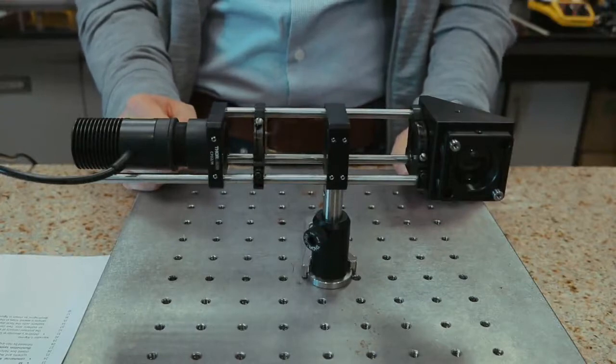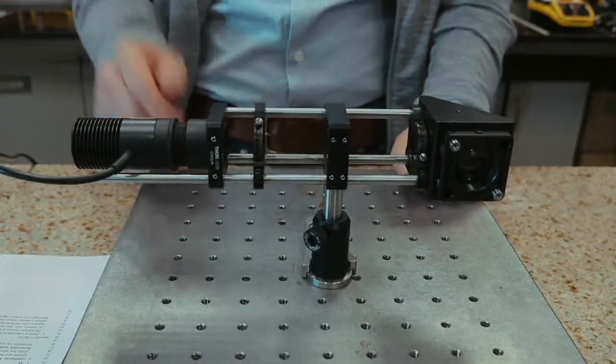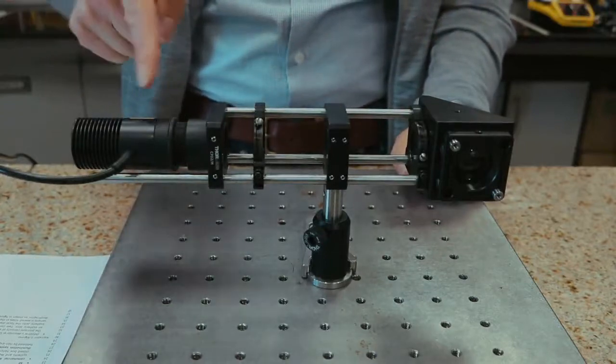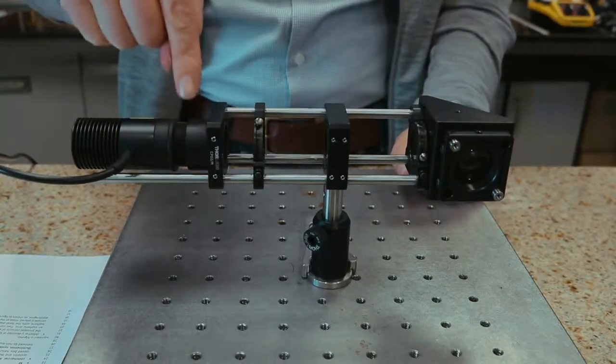Briefly, the setup that can be built with the protocol consists of a light-emitting diode whose light we collect and collimate with an aspheric lens.